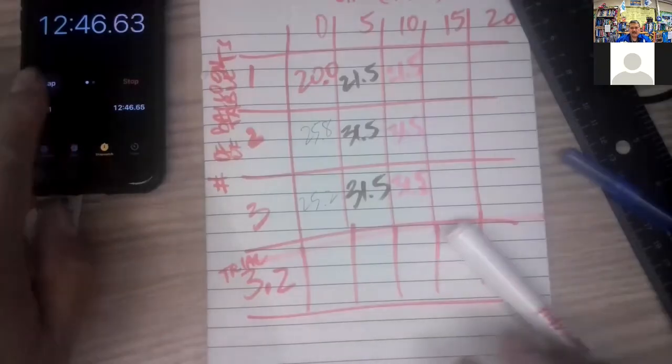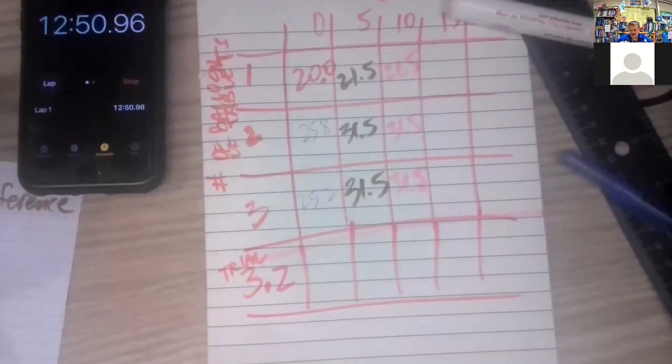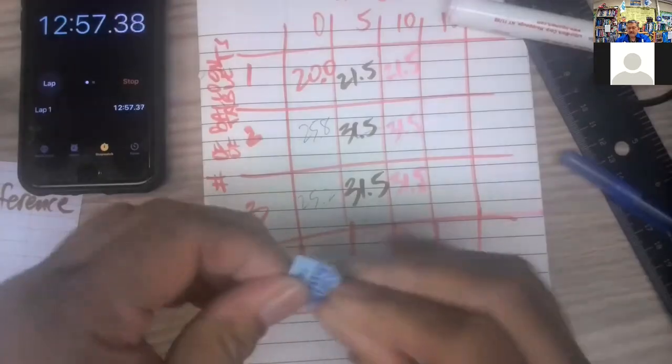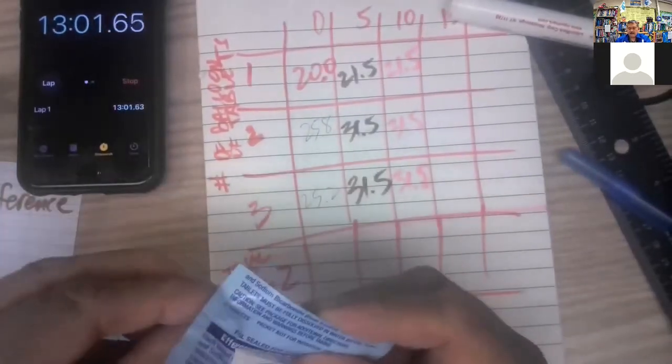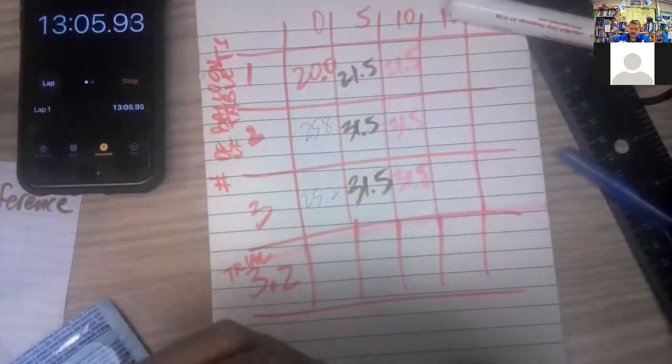So let me do that. And wind the clock over here. Check it again around 15. Take a couple more of these and crush them up. See what we get. So I'll take that one out. 3 all together.